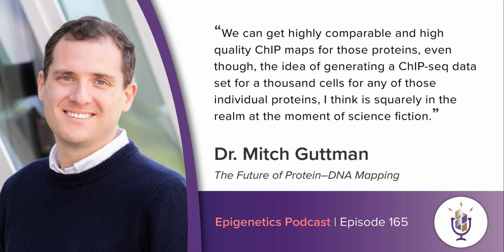But we can include them in our pools as a way of effectively testing whether or not these are ChIP-grade antibodies. And so it becomes a way to screen antibodies, but it also becomes a way to build consensus maps. Because if we see that 3 different antibodies against the same epitope give us similar patterns, we can validate that, in fact, this is likely a specific map for this protein. And that's been a really powerful approach.